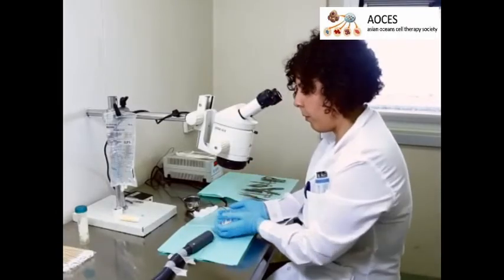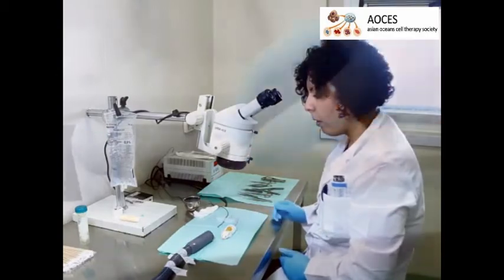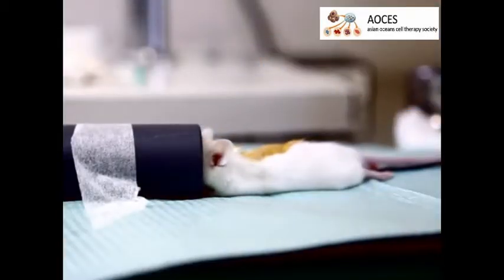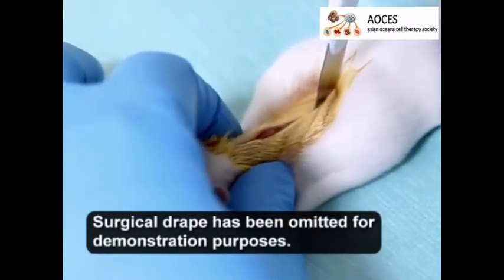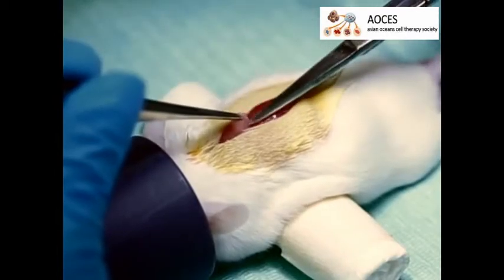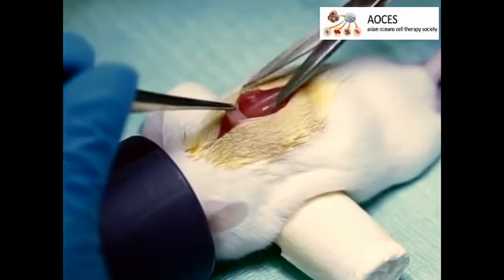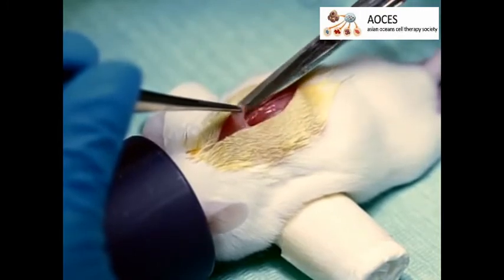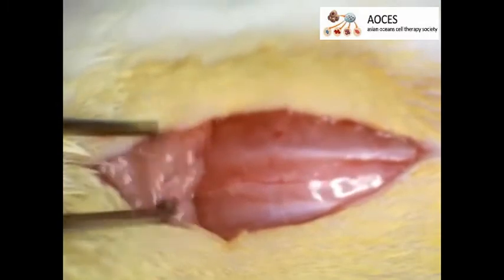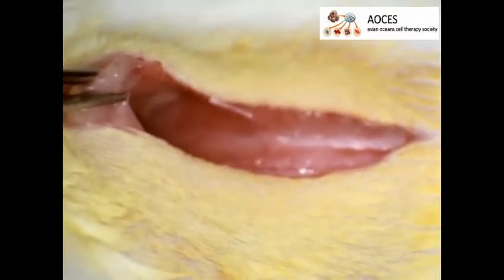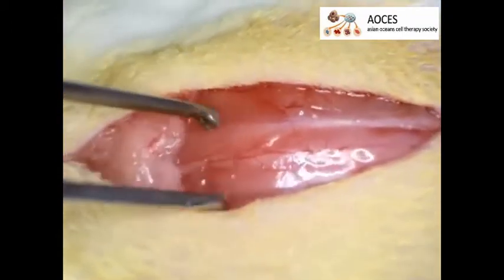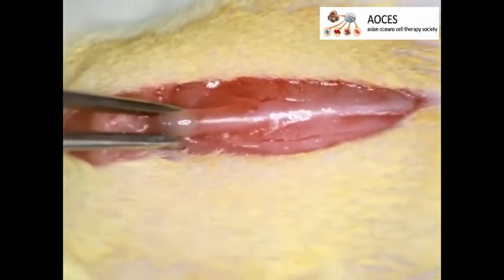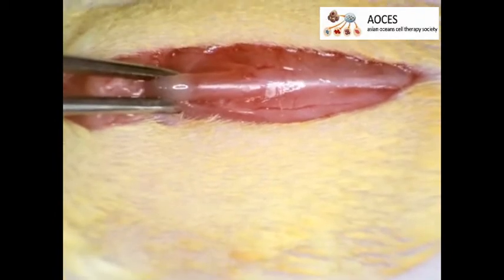After preparing the surgical area and mouse according to the text protocol, place the animal dorsal side up on a slide warmer to avoid hypothermia during surgery. With a scalpel, make a vertical incision over the region of interest from T7 to T12. Using forceps, hold the skin and superficial fat pad found between the 5th and 6th thoracic processes. Under a stereo microscope, count the process under the blood vessel as T6, then move to T7. Place a little bearing under the ventral side of the mouse to increase the curvature of the spine and use graphe forceps to block the spine to immobilize it.